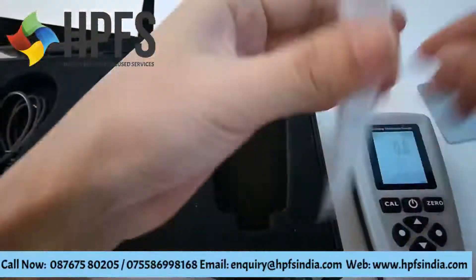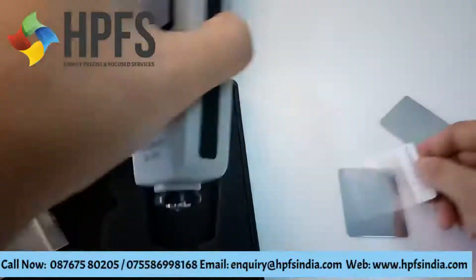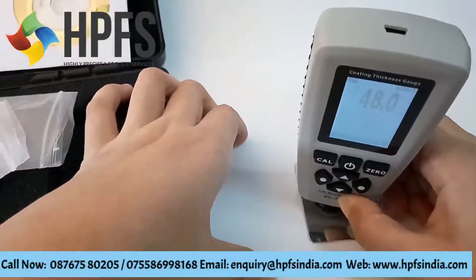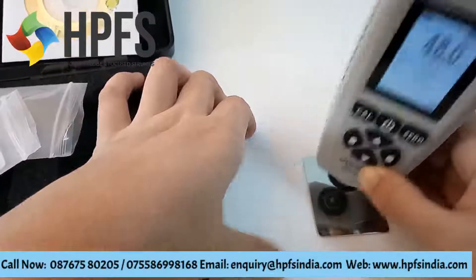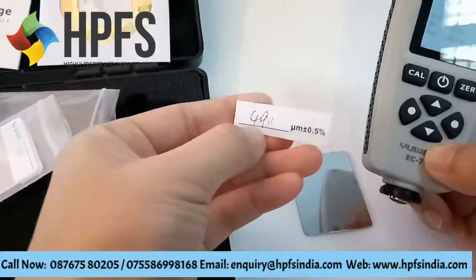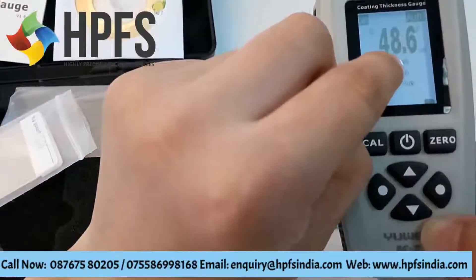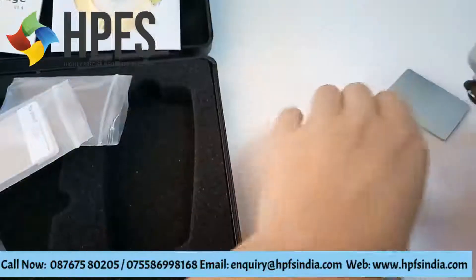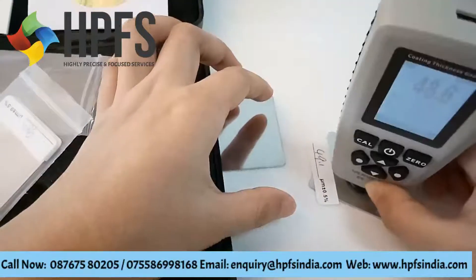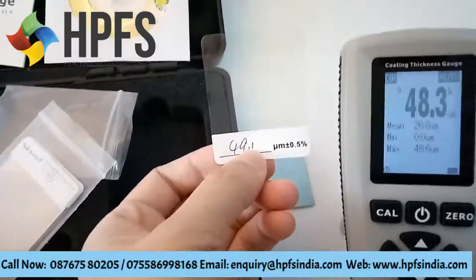Now we can check the standard plastic film to prove the data is correct. The standard plastic film thickness is 46.1, and the device shows 48.6. Very good — close data.